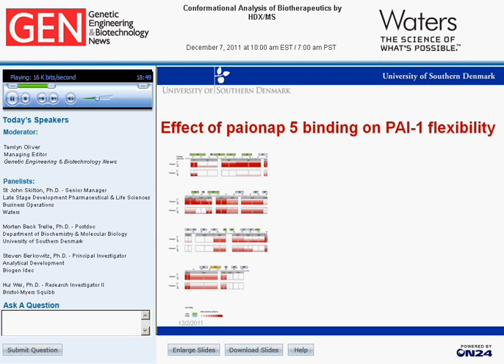And we then add in a third block, and in this block we calculate the difference between the two upper ones and color that according to a white to blue color scale, so that nearly white indicates peptides where there's no difference between PAI-1 without PioNAP bound and with PioNAP bound, and the dark blue ones are those that get highly protected by PioNAP5 binding. Again, this all looks very beautiful, but it's a little bit difficult to interpret the data in terms of the three-dimensional structure. So I, again, have tried to transfer this information onto the three-dimensional structure. So that is shown on the next slide.